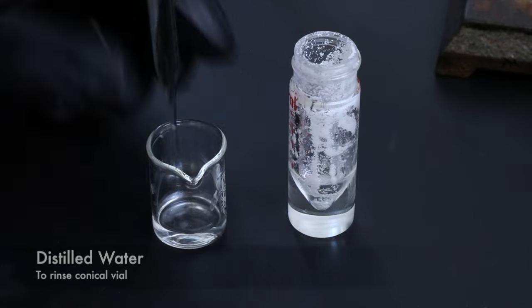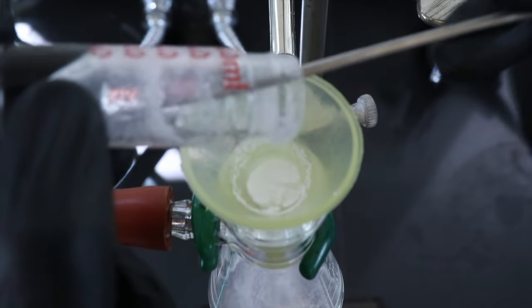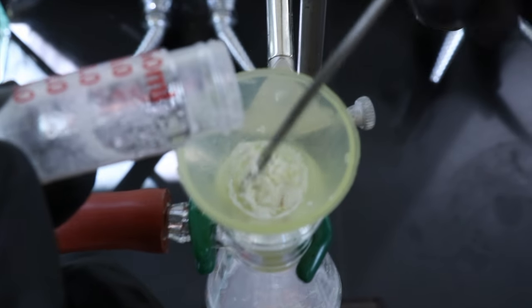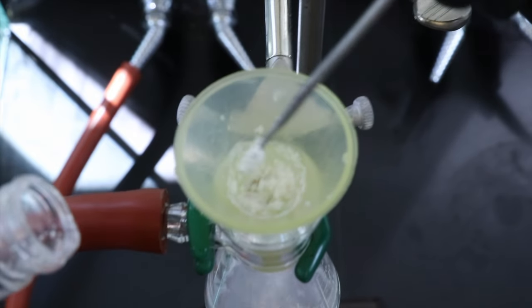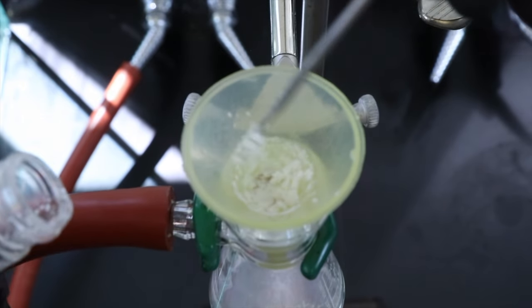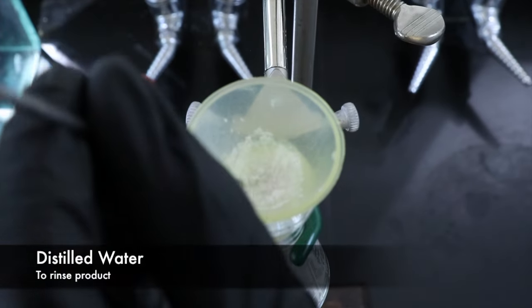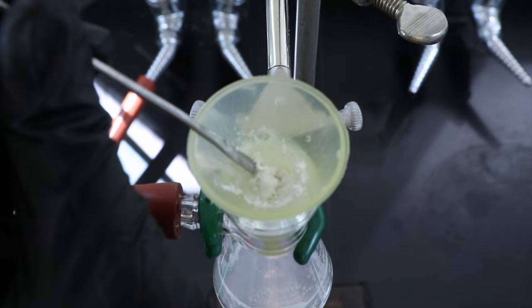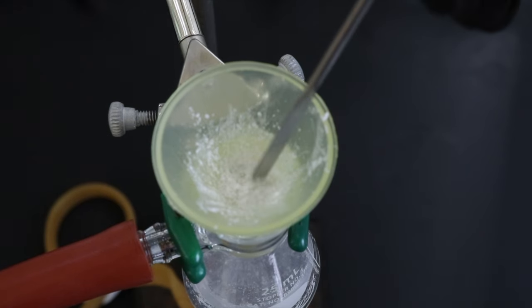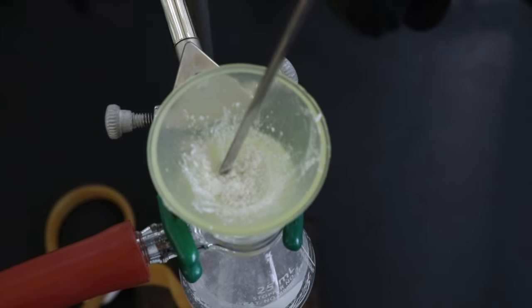I'll rinse the conical vial with some distilled water to help remove remaining product that was left over, and then I'll dump it into the Hirsch funnel. This will also help rinse off any ions or pull anything out that isn't the product. As you can see, it's pretty sticky and clumpy right now, but eventually that'll dry out. I'll keep rinsing it with water just to make sure that I dissolve and remove anything that I don't want there. And after a few minutes, you can see that the crude product is a lot more dry now and is probably ready to be removed.